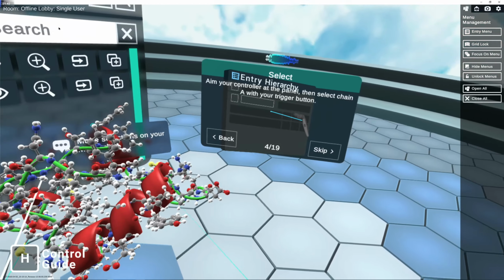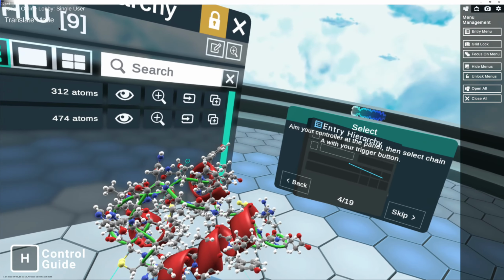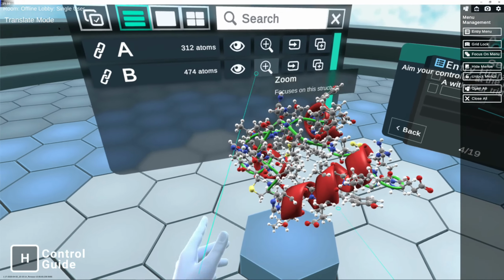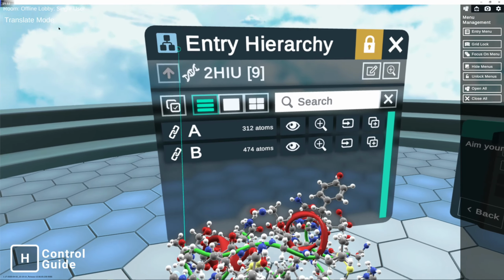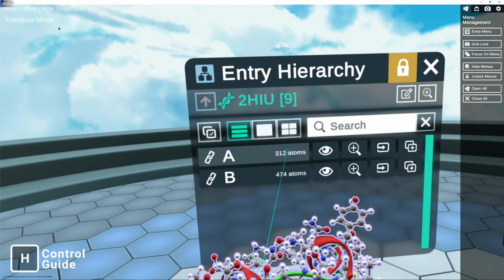You have the ability to select different parts of the structure. For example, you can select the entire structure, a specific chain, individual residues, or even a single atom. In front of you is your molecular browser that displays your control panel for each of these categories.